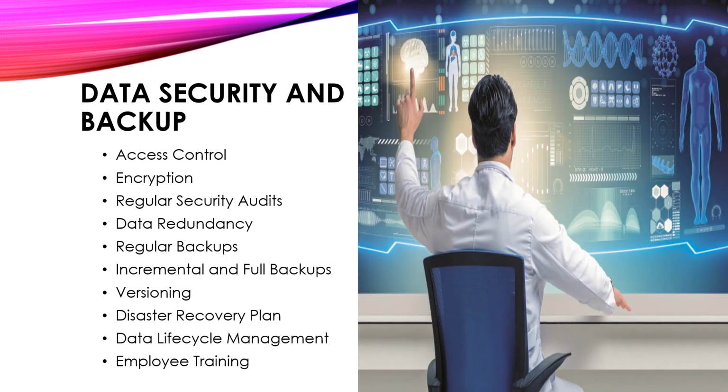Data security and backup. Now, data security and backup are critical components of laboratory information management systems or laboratory management systems. These systems handle sensitive data such as test results, patient information, experimental data, and more. And the following are some key considerations for ensuring data security and implementing effective backup procedures in laboratory management systems.